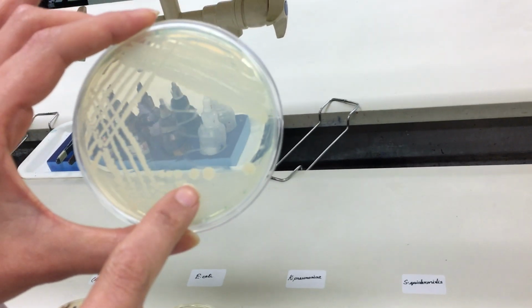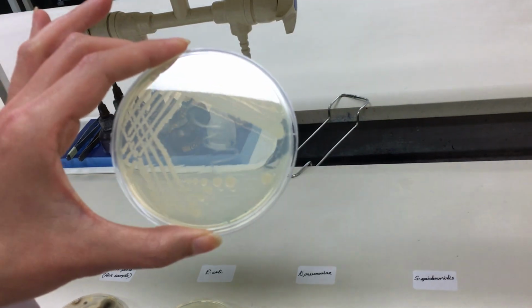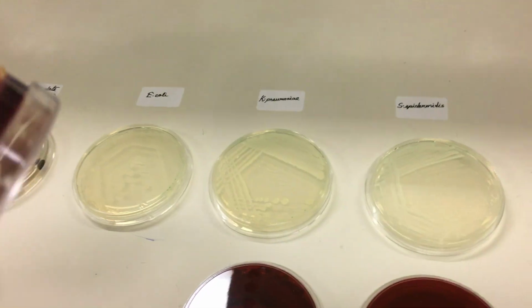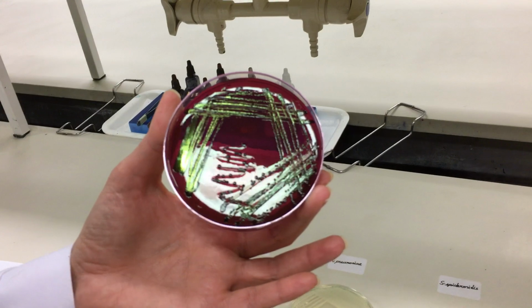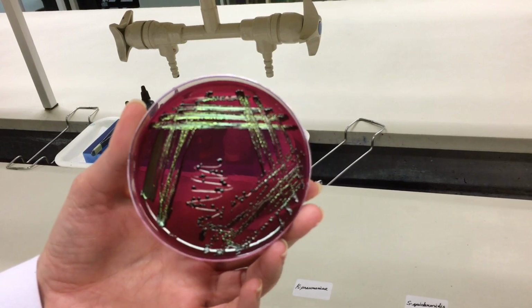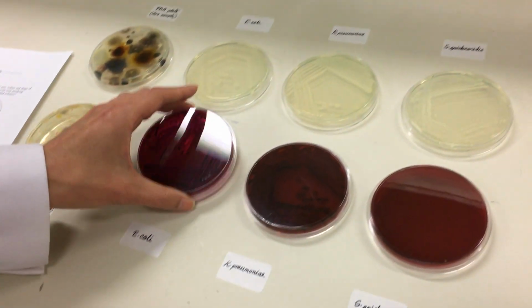So again, you need to refer to the characteristics of the colony and explain the size, shape and color. This is one of the metallic green colonies of E. coli. So you need to explain how it looks like.